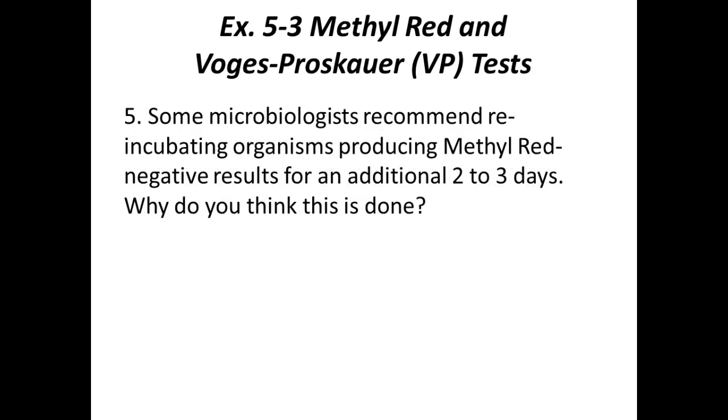Some microbiologists recommend re-incubating organisms producing a methyl red negative results for an additional 2 to 3 days. Why do you think this is done? What's going to happen over that longer incubation period? It's going to grow more, so therefore it's going to produce more. What are we measuring in this test? Acid. It's going to produce more acid, so therefore hopefully it ends up being that really low pH of 4.4.